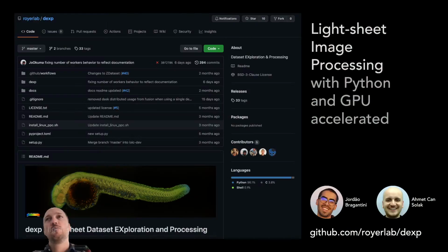Yeah. So as I mentioned before, there was a lot of effort put into designing software to process and render these images, because of course you can imagine that the scale of the data now is, since you can scan along one dimension almost for millimeters, the amount of data you're generating here is just nuts, right? And when you think now that this is live imaging, maybe every 20-40 seconds, depending on the size of the sample you're looking at, you're generating a lot of data. So it's really tricky, and so we put quite some time.